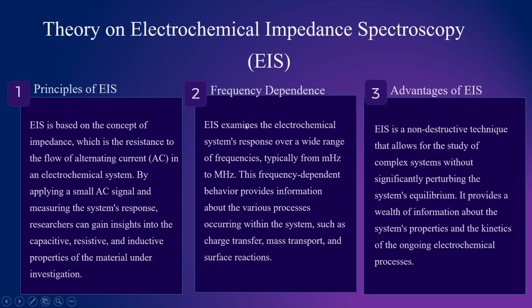And for frequency dependence, EIS examines the electrochemical system response over a wide range of frequencies, typically from millihertz to megahertz. This frequency dependent behavior provides information about the various processes occurring within the system, such as charge transfer, mass transfer, and surface reactions.